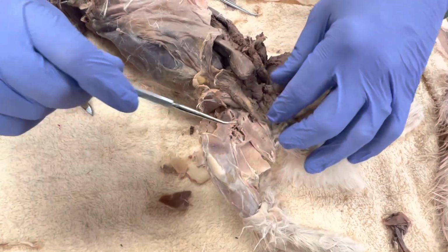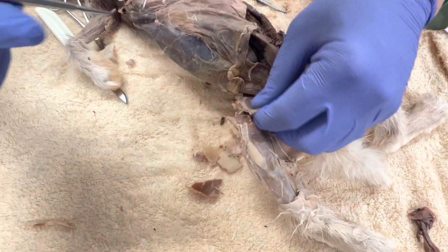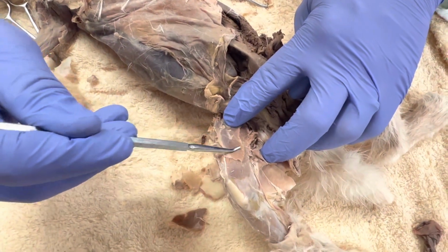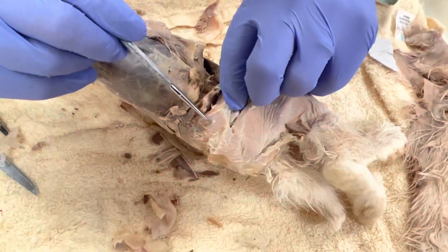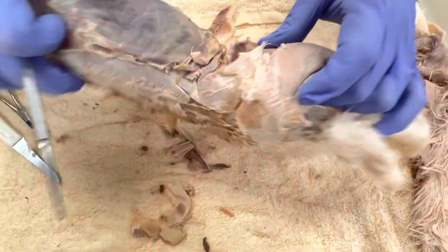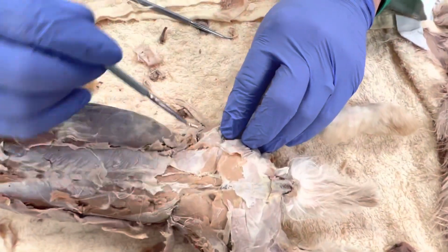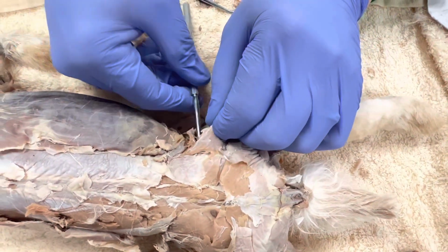So there's the muscles of the inside of the thigh and actually on the top of the thigh. Oh, one last thing. This here is going to be my tensor fascia lata. So it's going to come like this, and this is kind of torn, but it's actually going to connect over in here. And actually, being that we're on this is my Gluteus Maximus right here. That's the Gluteus Maximus right there.